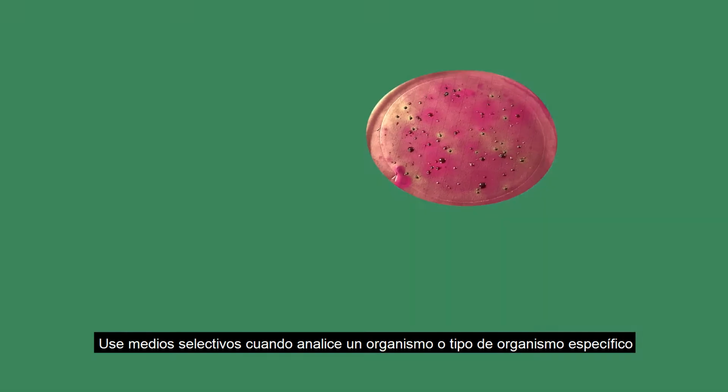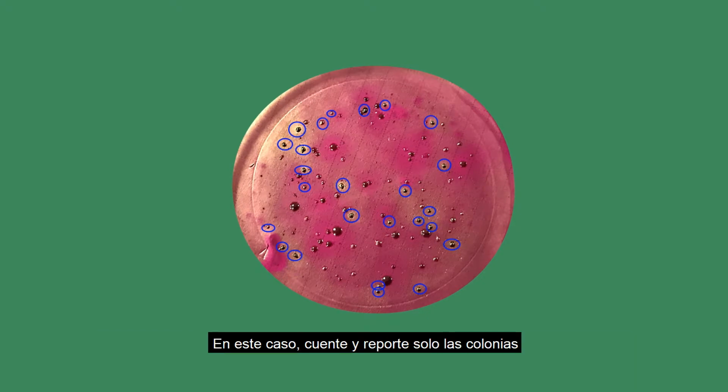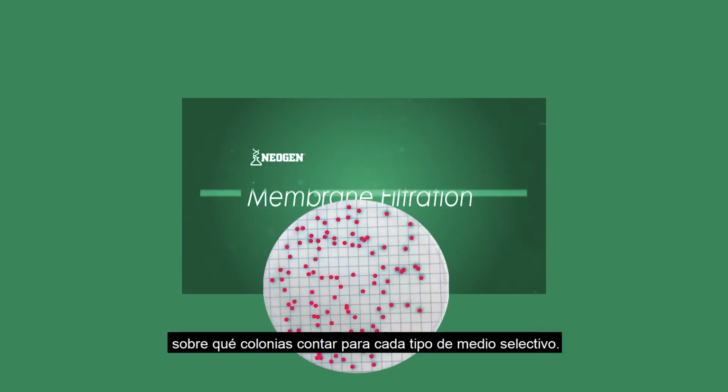Use selective media when testing for a specific organism or type of organism, such as coliforms. In this case, count and report only colonies that exhibit characteristic traits specified for that medium. See the video on membrane filtration products for more information on which colonies to count for each type of selective media.